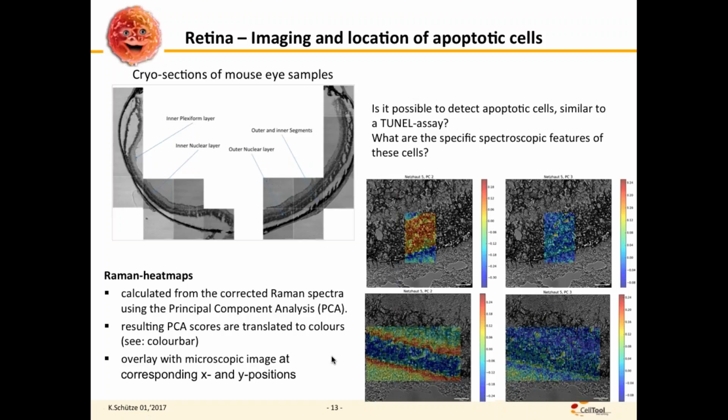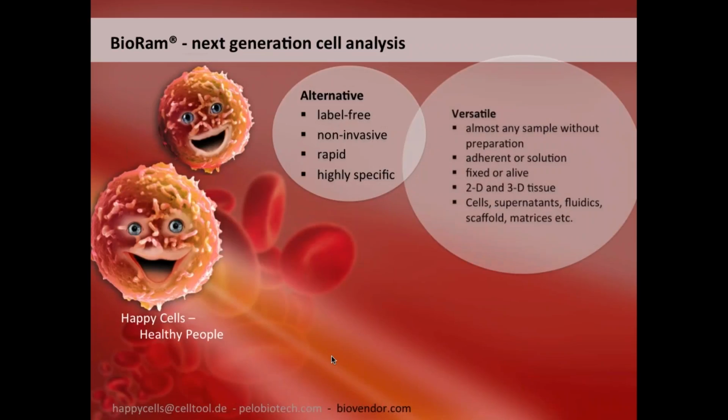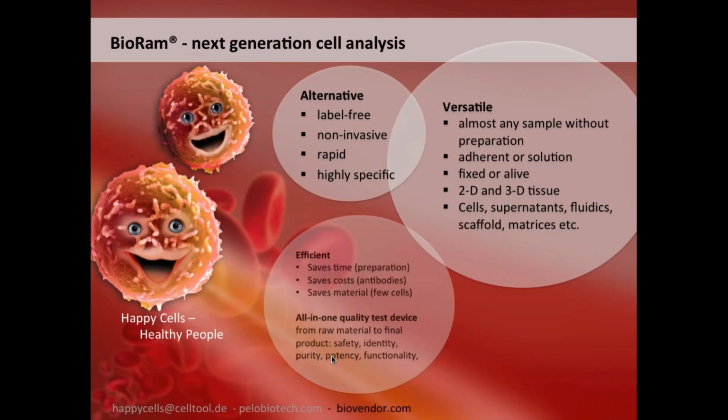This is a very preliminary test we have done so far, and we would like to continue this proof of concept. So this was just a rough overview I wanted to give to you about how Raman can be used in the 3D environment and with living cells and even living grafts. Especially as we don't need antibodies, we can right away look into the 3D grafts, and we can measure their reaction on any kind of fluidics or drugs when they start to work on the 3D structure.